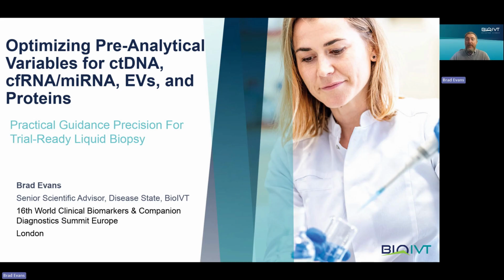Today, I want to focus on something that has quietly become one of the biggest determinants of success or failure in liquid biopsy studies, and that is pre-analytical control. This talk is not about the newest sequencing chemistry, and it's not about AI classifiers or advanced bioinformatics pipelines. Those technologies are moving incredibly fast, but what we are seeing across the field is that analytical sensitivity has improved faster than our control over the samples those assays depend on.